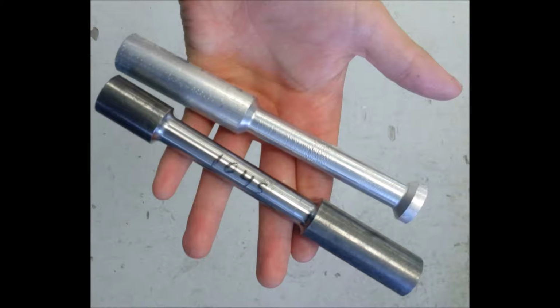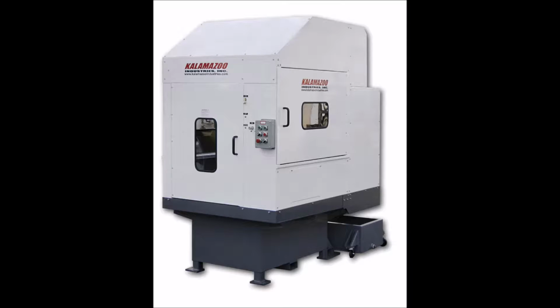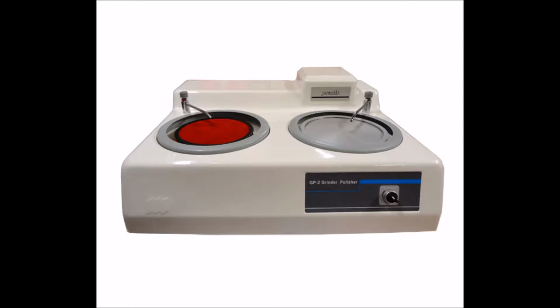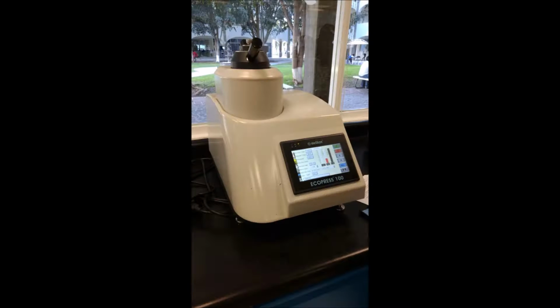Hope you enjoy it. To develop this first practice, we use some materials and equipment like steel, aluminum, some reagents, an abrasive disc cutter, a mounting press for metallographic. To start, we cut small pieces of aluminum and steel in the abrasive disc cutter.